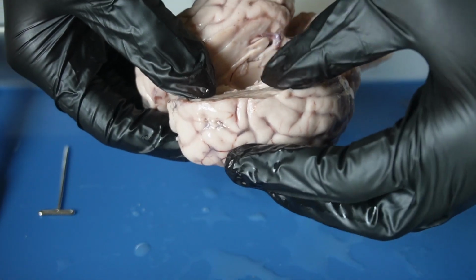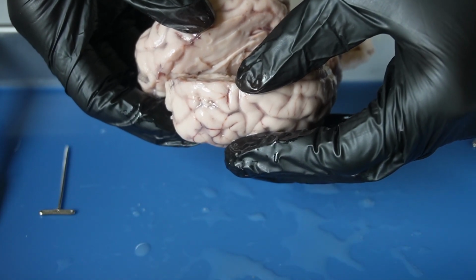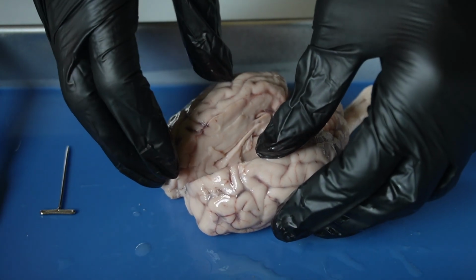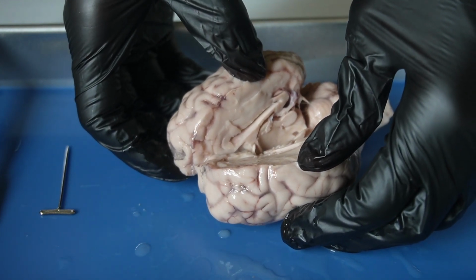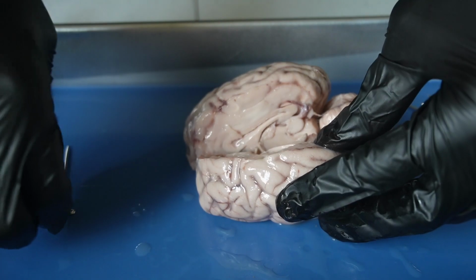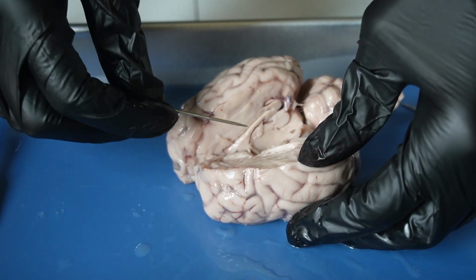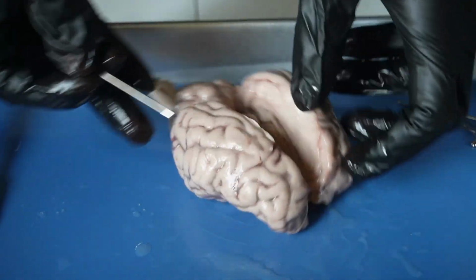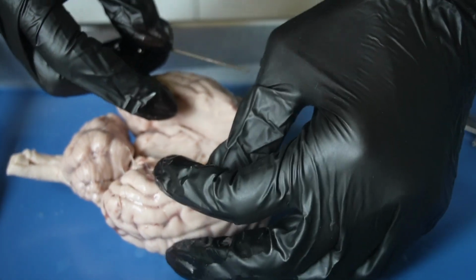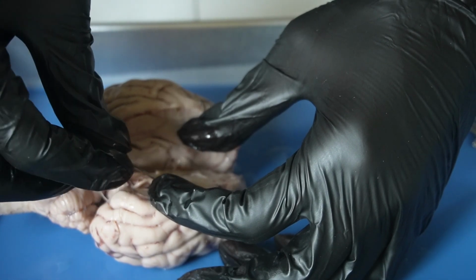Okay, and then my last brain structure is the hypothalamus, which would be, if I can find the ventricle, the hypothalamus, oh my goodness, would be here.